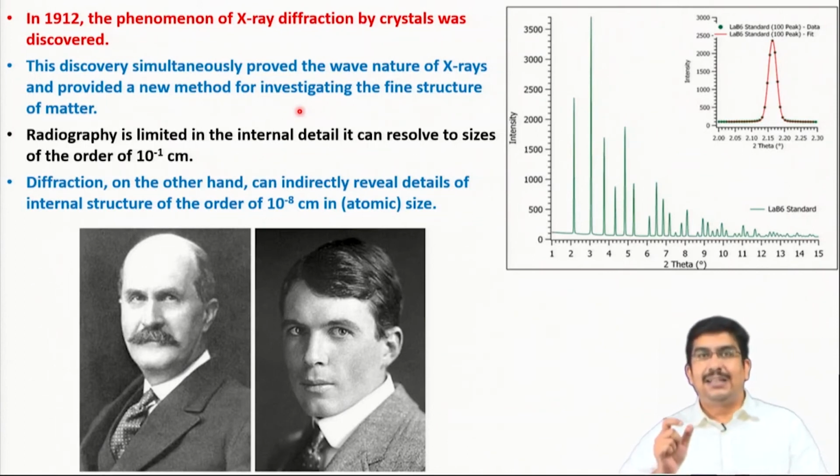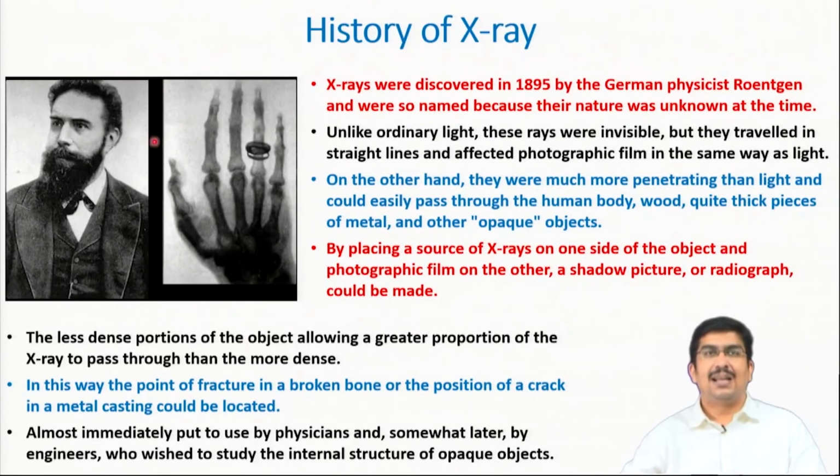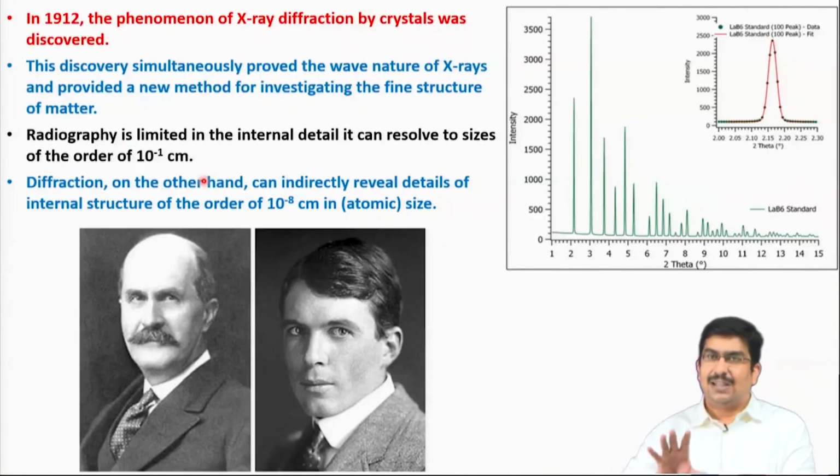can now resolve internal details only to the order of 10 raised to the power minus 1 centimeter, pretty much in the millimeter range. The spatial resolution of the radiographs that you are seeing here is in the millimeter range, and till today that is the limit people can go. But diffraction is one phenomenon whose resolution is at the atomic level, because the atoms are responsible for that phenomenon.